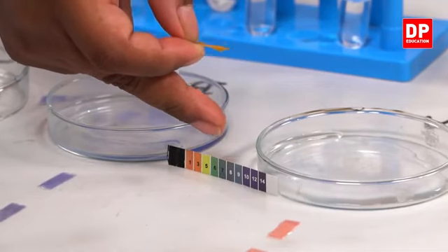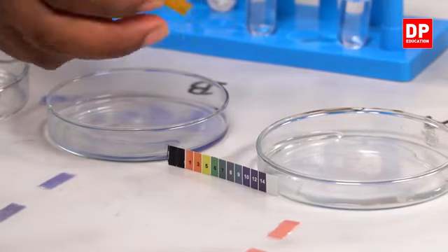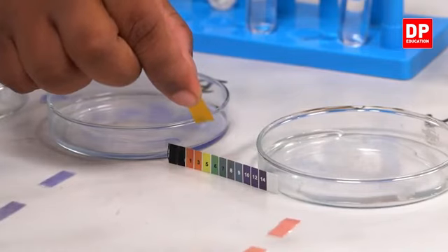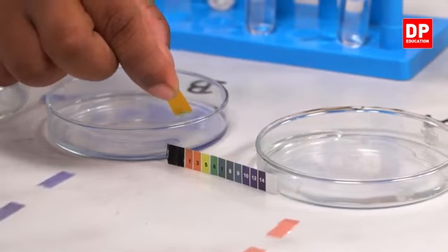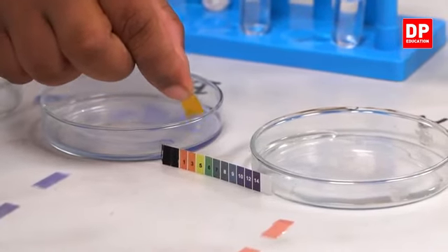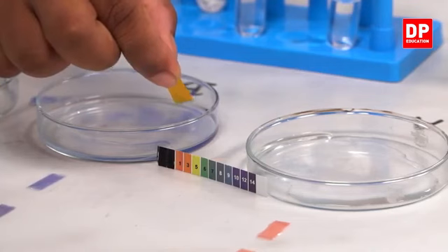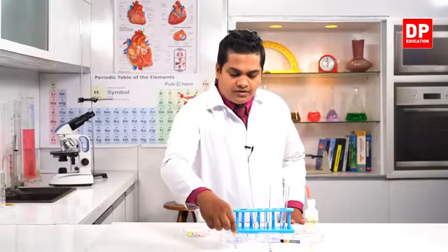You can observe the fifth color, 1, 2, 3, 4, fifth color. It has a light yellow color, but the paper in my hand has some amount of a greenish yellow color. So it's greater than 5 but less than 6. We can say it's nearly about 6 to 7, the pH value, right?